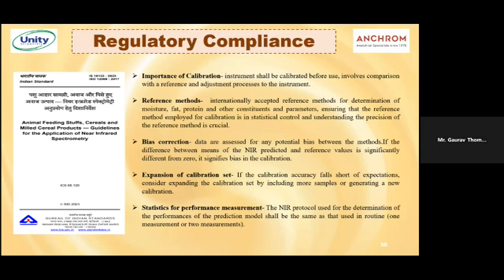Next, it also talks about the statistics, performance, and measurement. The statistical analysis that the instrument performs to give you the results and achieve those results every time you analyze your sample, it also tells about that. So, this is what our ISO 12099 talks about.